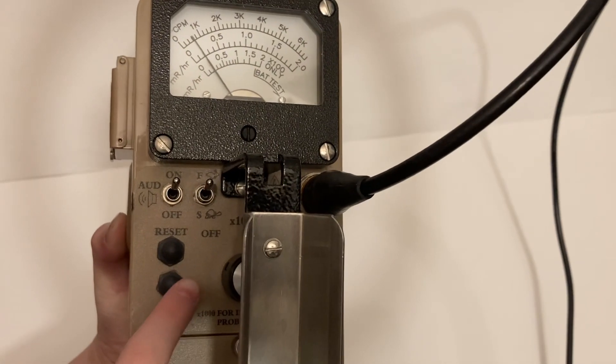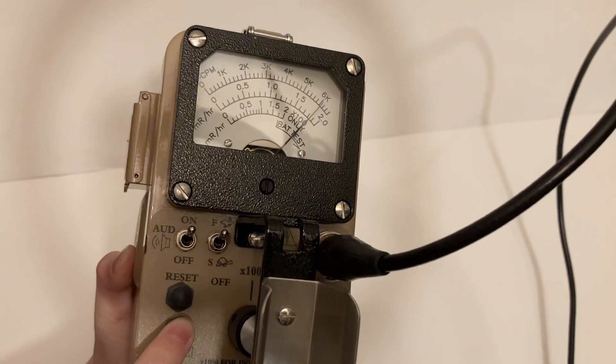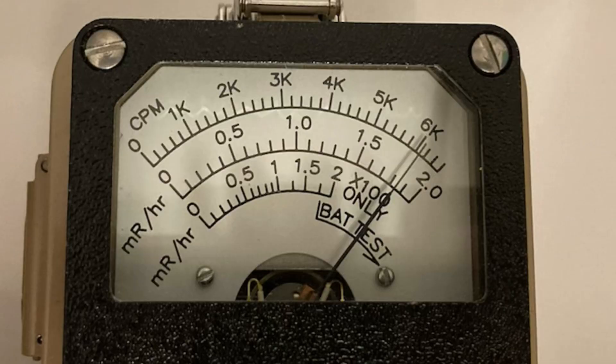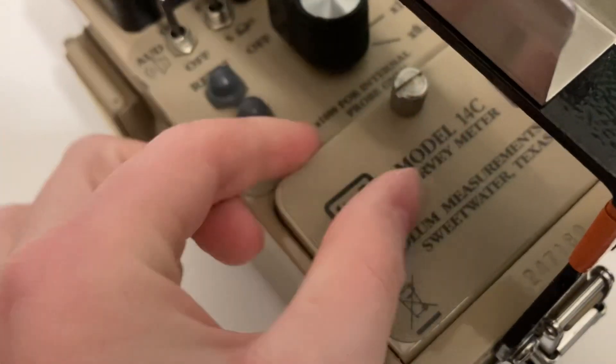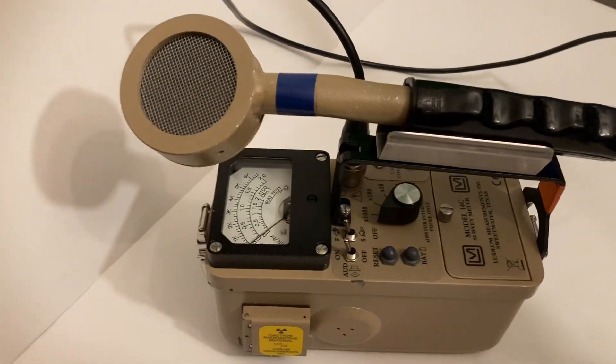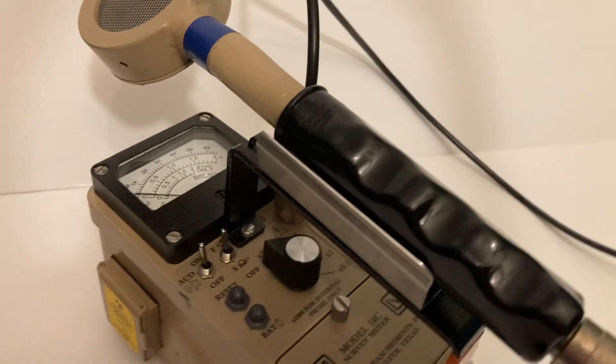Now hold down the bat button on the front panel of the instrument. Make sure that the needle passes the first vertical mark on the dial. If not, change the batteries immediately. If it passes the battery check, the instrument will be ready for use.